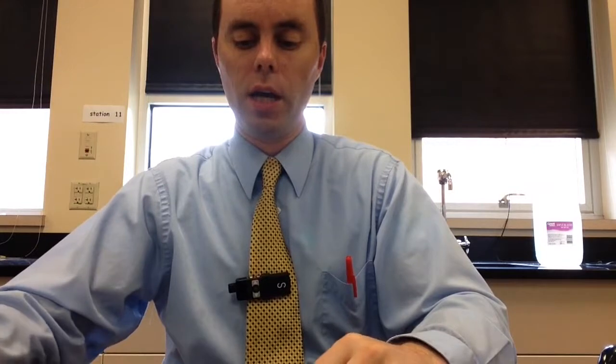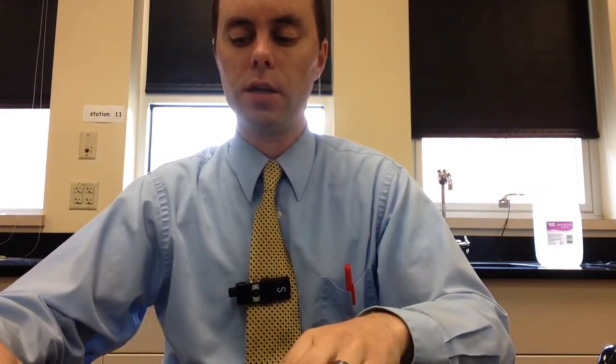What you're doing is checking to see the melting point, because they should be heating at about the same rate since they're on the same hot plate. You'll be able to see which one of these has the lower melting point, the sugar or the salt, and you'll record those observations back here where you've got the time it took to melt. If you make it to 10 minutes and it hasn't melted, then that's it. You don't go any further than that.